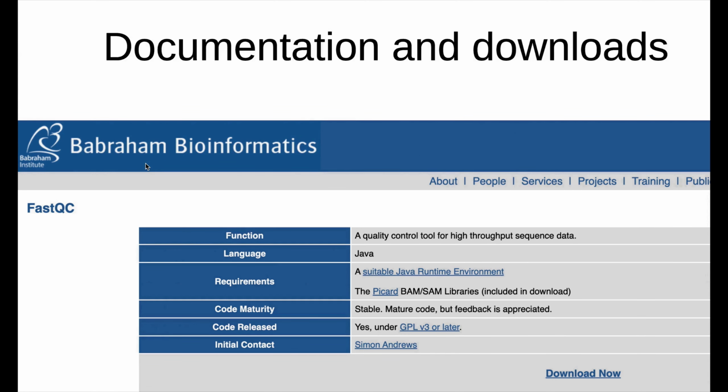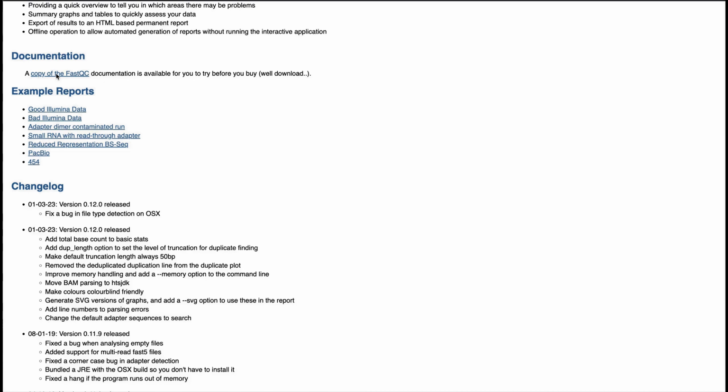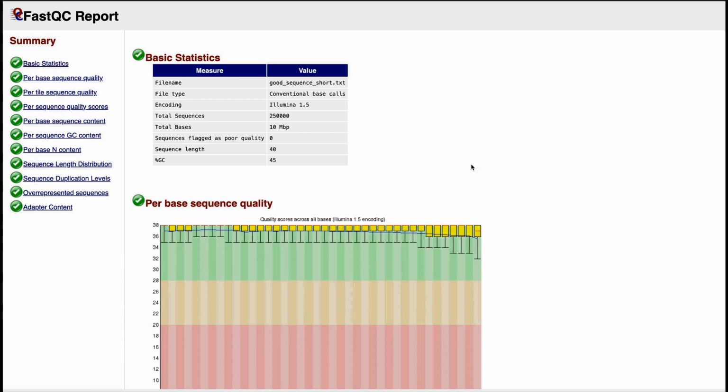It's a pretty nice site. You will find a link to the detailed explanation of how it will analyze any given fastq file, and examples of good and bad Illumina data. The way it looks is the following. It is an HTML page made of a series of colorful illustrations. You open one of your files and it will tell you first some basic information about your file.